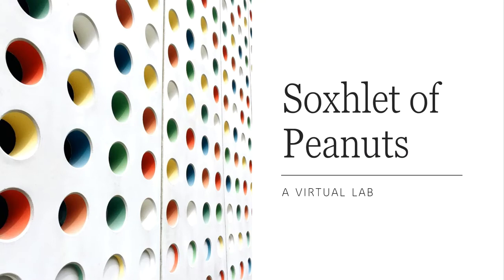All right. So good luck with the lab notebook. I think that's all of the information that you need to write a really good lab entry. And it's also the calculations and the numbers that come along with it as well. That probably is going to take you a little bit longer just because there were quite a few different balance masses and stuff that we have to worry about here. So you'll end up with a direct percentage of peanuts. You'll end up with an indirect percentage of peanuts.